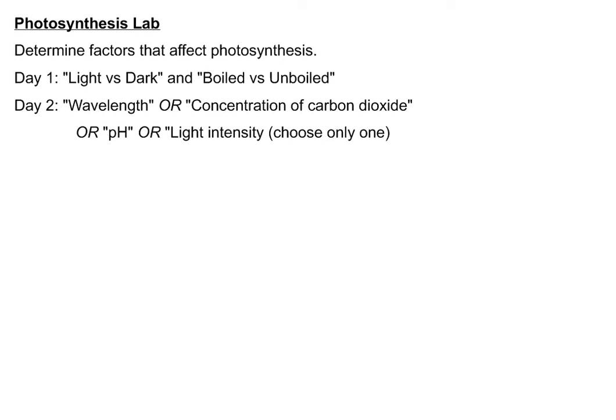All right, this is your photosynthesis lab pre-lab video. What you're going to be doing is determining factors that affect photosynthesis. Now, this is going to be a 2-day lab. The lab itself is going to be conducted the same way both days. You'll just be testing different variables on day 1 than you will on day 2. So on day 1, everyone is doing the same lab.